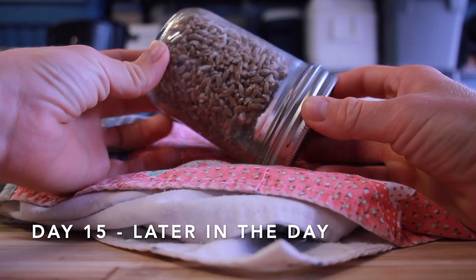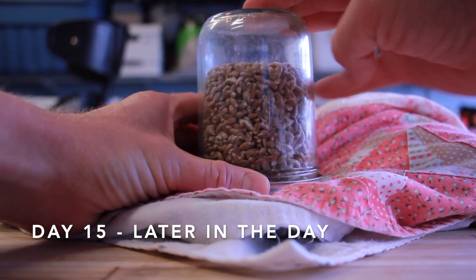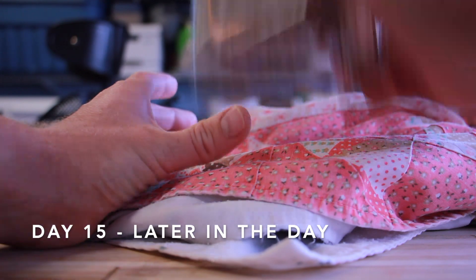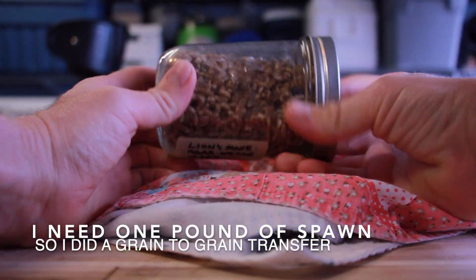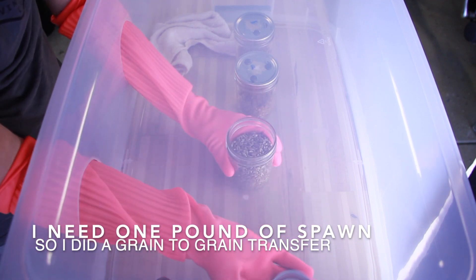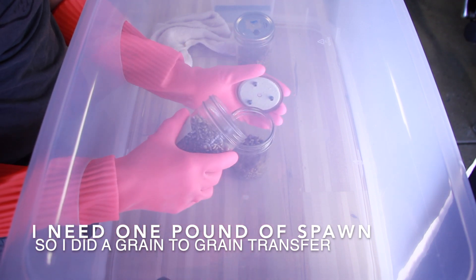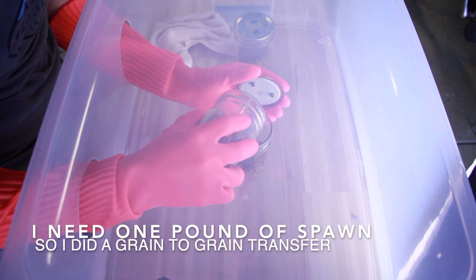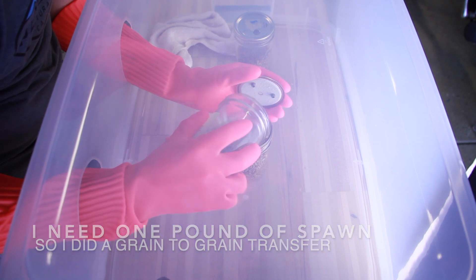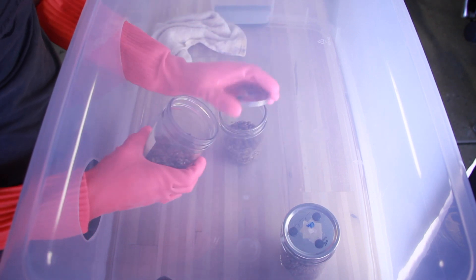On day 15 I finally did some math to figure out how much grain spawn I was going to need. I'm doing a five pound block of hardwood — well, enriched hardwood — and I wanted to do about 20% spawn to bulk substrate, so I needed a pound of grain spawn. I did a grain-to-grain transfer onto some new grain, and here are just some quick clips from that. I'll post another video, and by the time this video comes out I think that grain-to-grain transfer will already be out, and I'll just put a link to that above.